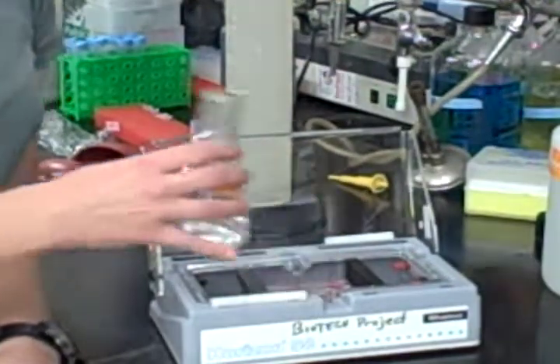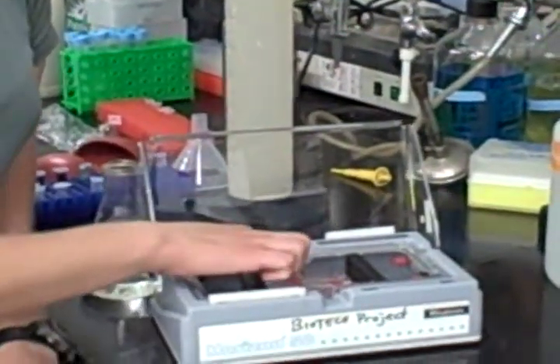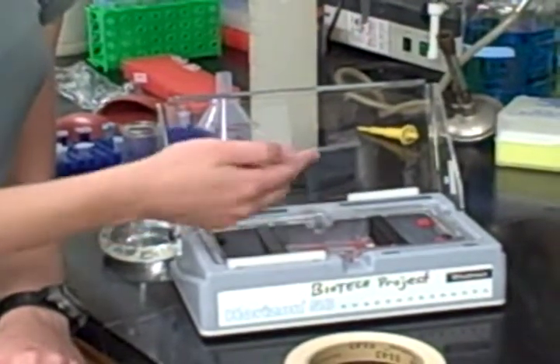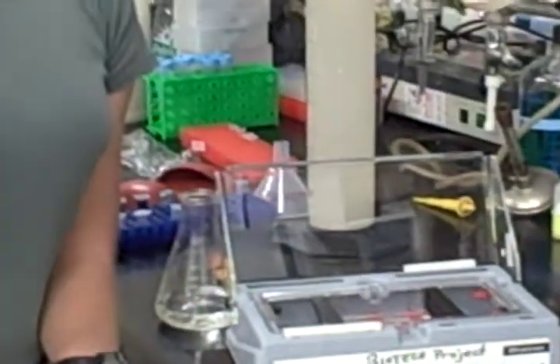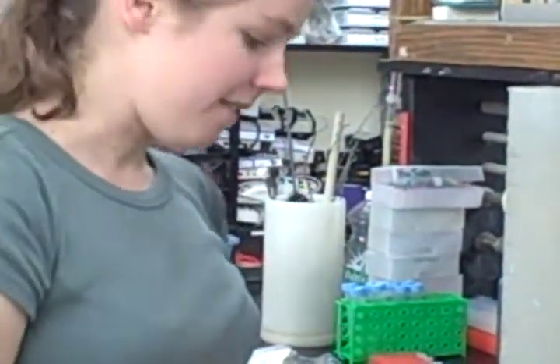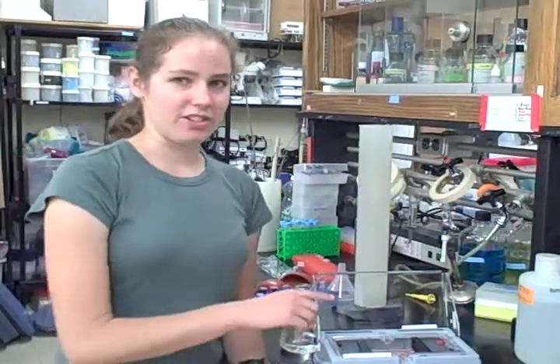Once you think you've poured enough, take your finger and place it on the lip of the cast to make sure that the agarose is high enough. If you get agarose on the tip of your finger, that means you have enough agarose in the gel. If not, pour some more and check again.